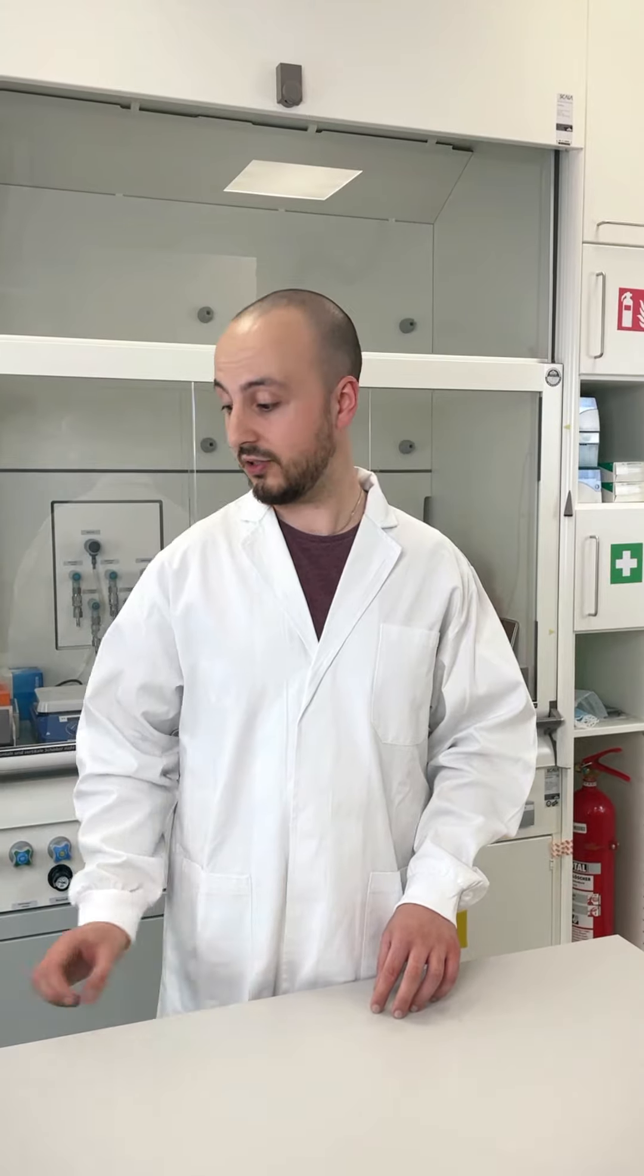Hi, I'm Konstantin from Acquarray and today we will start with our new series of tutorials where I will teach you everything you need to know about the Droplet Microarray. In our first video I will talk about the technology and introduce you to our product Droplet Microarray slide.